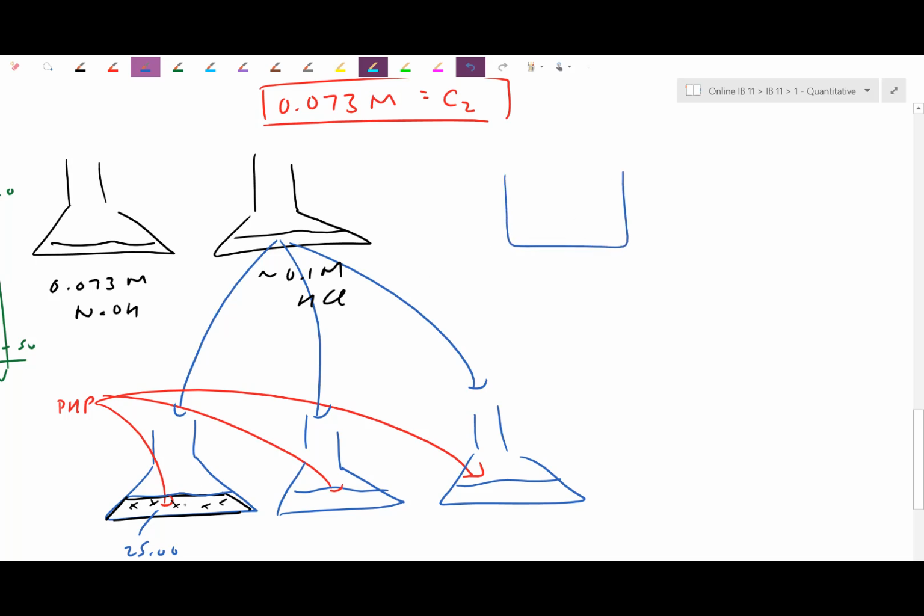You may actually have done 25, 25, and 25, but now that you know the concentration, these ones here are completely neutralized. They're sort of wasted samples, but now I know the concentration of my stock bottle is actually 0.095 molar. All right?